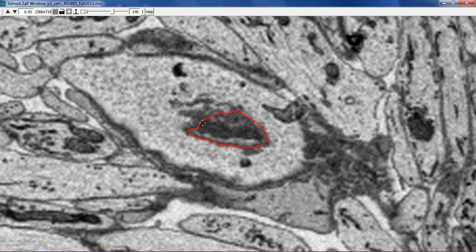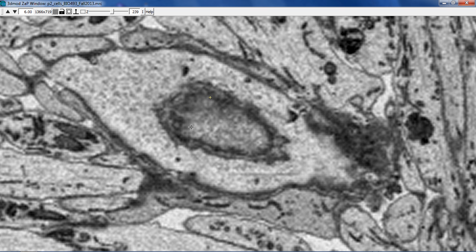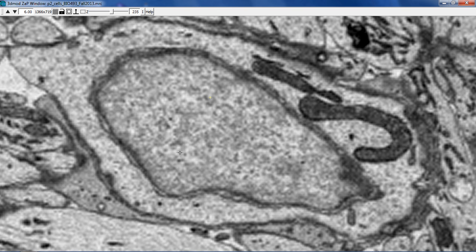Now instead of tracing the next contour, what we're going to do is we're actually going to skip a few contours. So we'll do 1, 2, 3, 4, 5. We'll skip to 5. And we'll trace this contour. It's a bit bigger. Now, if I feel like I'm running out of room on the pad, or I want to move my hand, I can just release the button and then click it again before I touch the pad again, and it will pick up where I left off. So let's get a contour here.